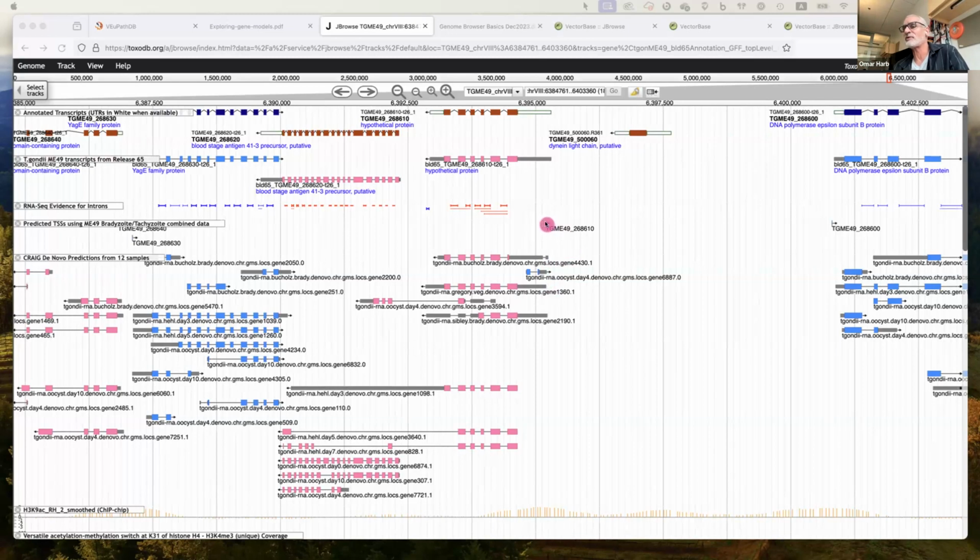This transcription start site data is like that. When you initially generate it, you will end up with lots of potential transcription start sites, but then based on the depth of coverage for each of these sites, and probably some other calculations, they come up with a value, and then they pick the one that they feel is the most accurate, the correct transcription start site. Not manually, obviously; they're doing this automatically across the whole genome. So sometimes that's wrong, and it won't be correct.